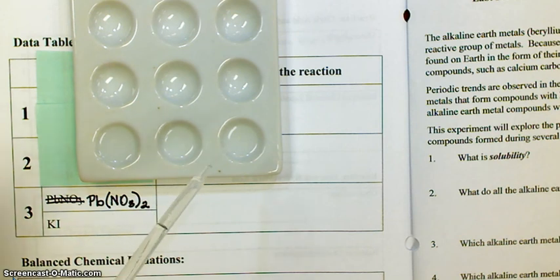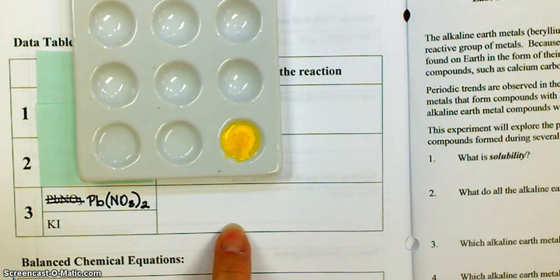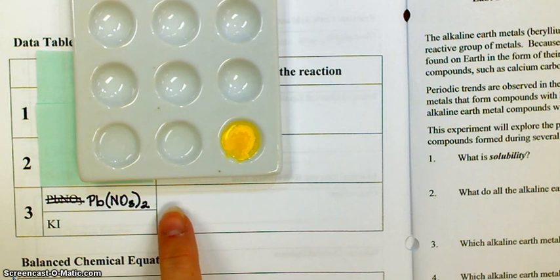All right, so the potassium iodide's there. Now I'm going to add the lead nitrate. Okay, and you can obviously tell that there is a definite color change from clear to bright yellow. And you can see that that kind of looks egg yolky. There's a precipitate in there. There's a bright yellow precipitate. Okay. So again, under the observations part, you should put formation of a bright yellow precipitate, and goes from clear to yellow.